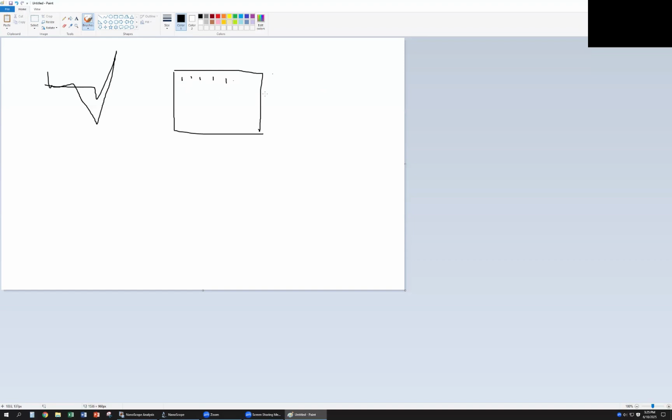This method is called force volume, sparse force volume. Force volume uses the one force curve with a triangle-shaped movement, so that means it's slow. If we want it faster, we change the movement to a sine wave. The sine wave method is called PeakForce QNM.